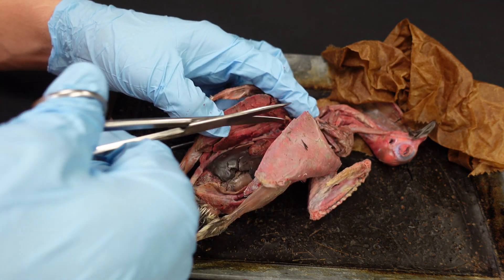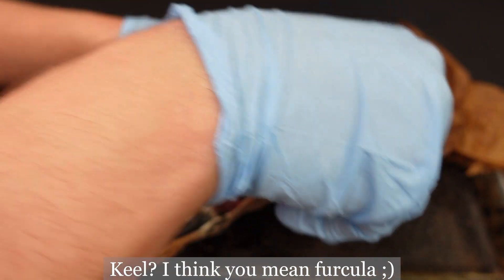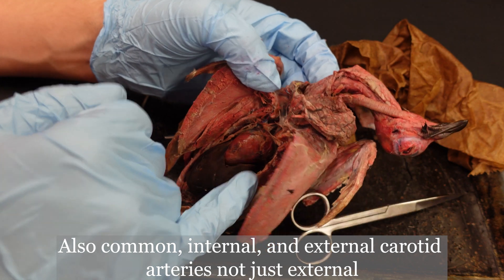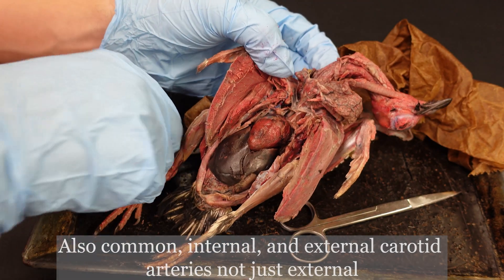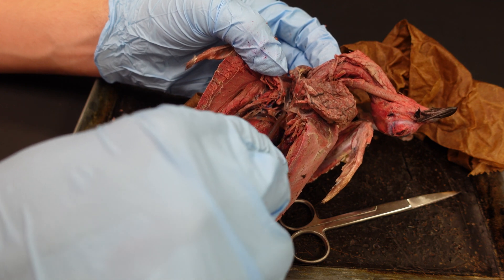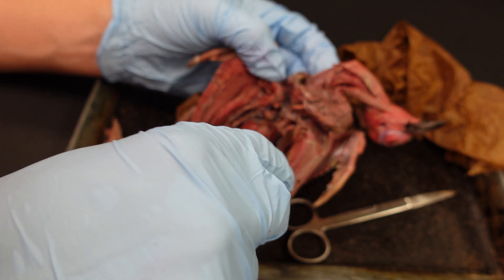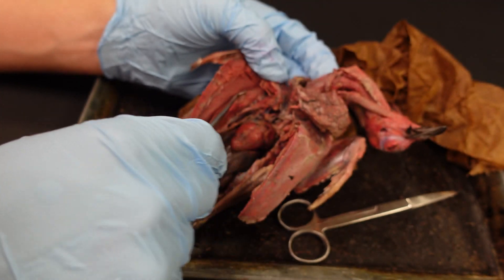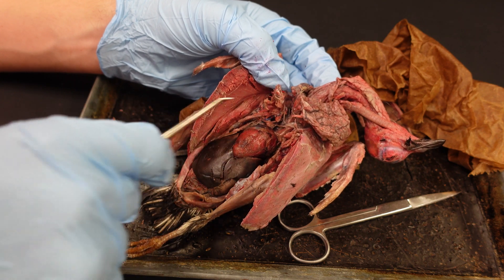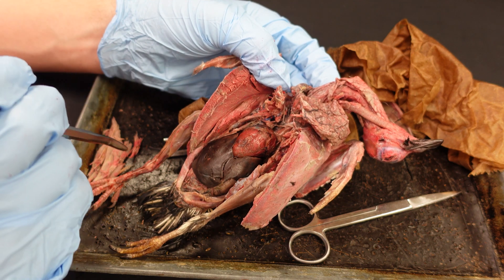One thing I'm going to do is cut through the furcula, which should help me see those external carotids a bit better. That looks great — it is a bit easier to access now. Definitely cut that furcula right down the middle, kind of like breaking the wishbone for Thanksgiving, but a little more gruesome looking.